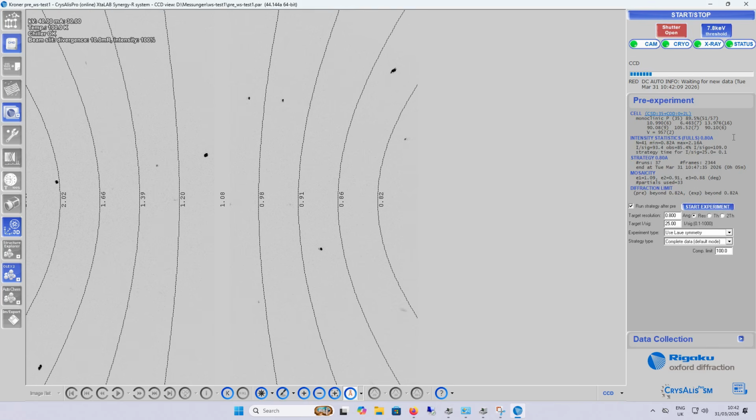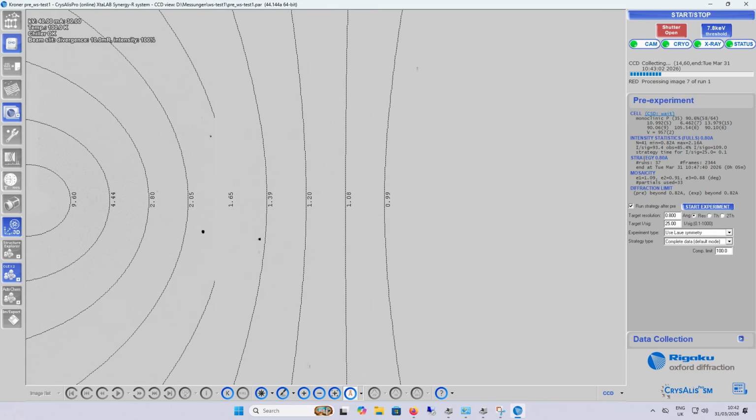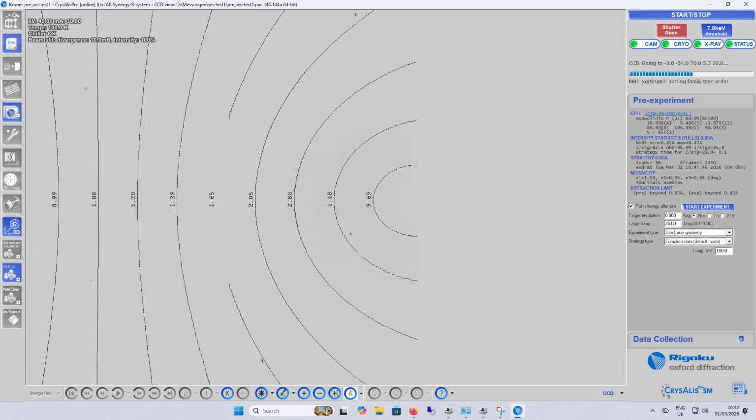We'll see what happens later. So we have about 100-ish reflections measured and indexed about 89%, not too bad.